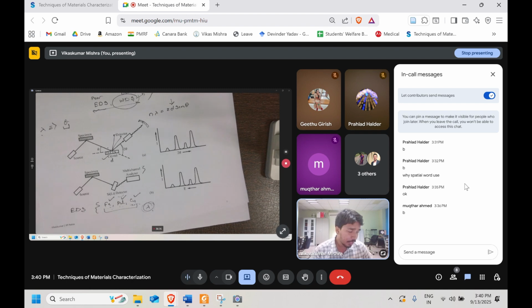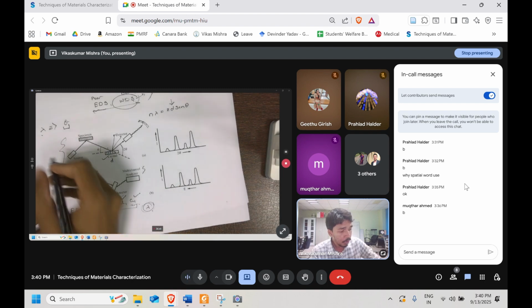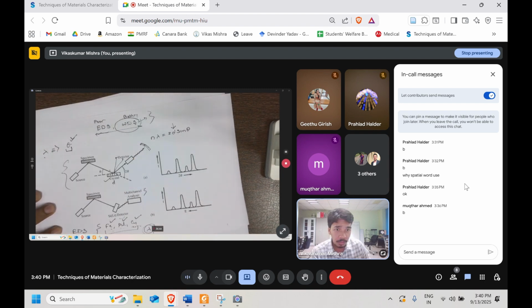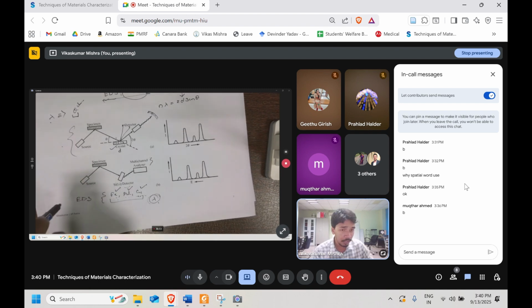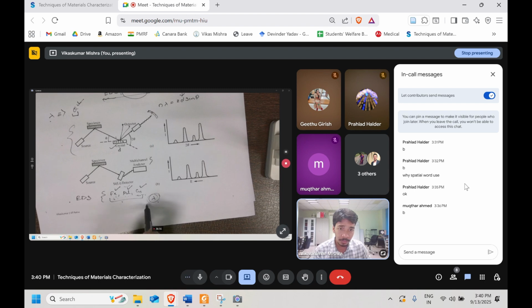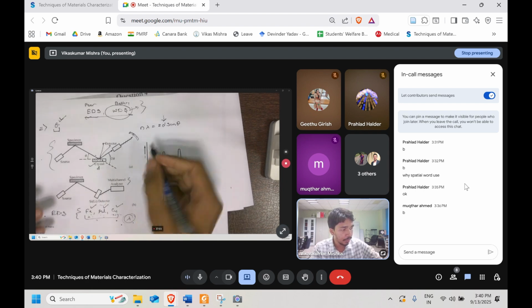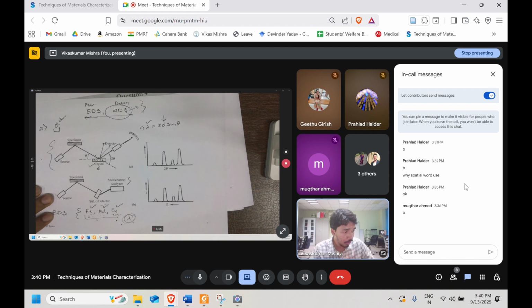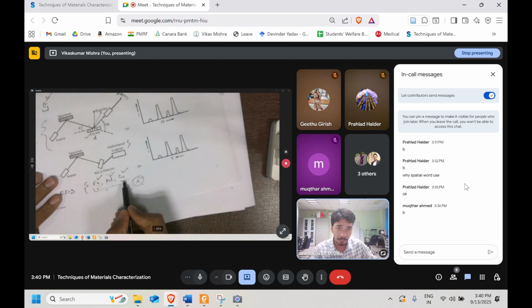So now the thing is that the precision over here is very high, because we are converting the signal to spatial resolution. Now again, see how we are going to use this. You made your specimen, you will not directly go and do the WDS. You will first use EDS to know what elements are present. Once you found which elements are present, you will have some rough estimation. You know the lambda, you know the d, you will try to find out the theta corresponding to each of them.